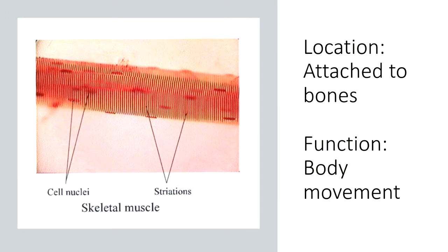Now we have three muscles before we look at nervous. This is our first muscle, skeletal muscle. This is also referred to as striated muscle, and if you look, you can see why. These bands are referred to as striations. And if you remember, something else that we talked about in lecture a few times is that this is one of the only multinucleated cells.